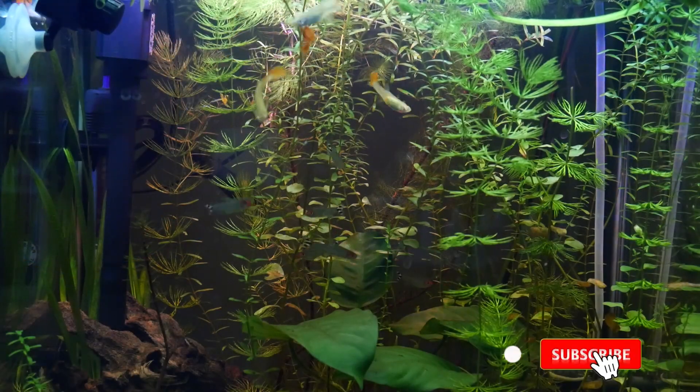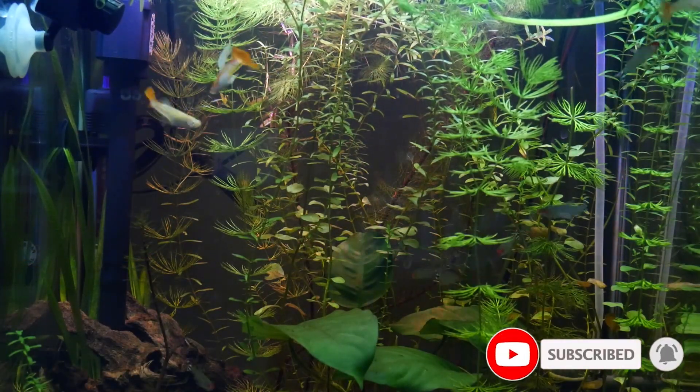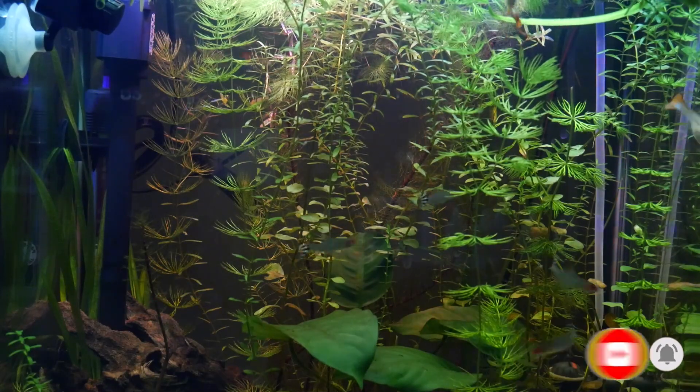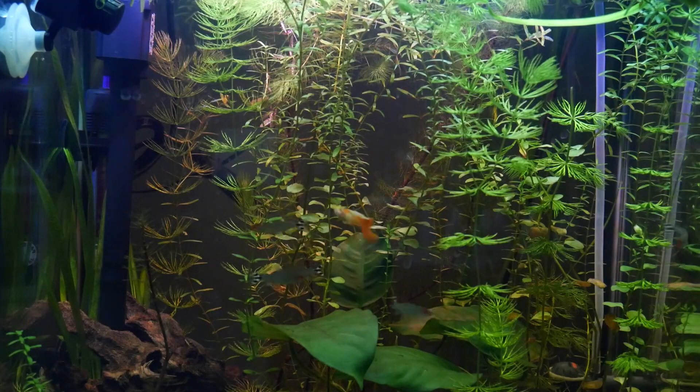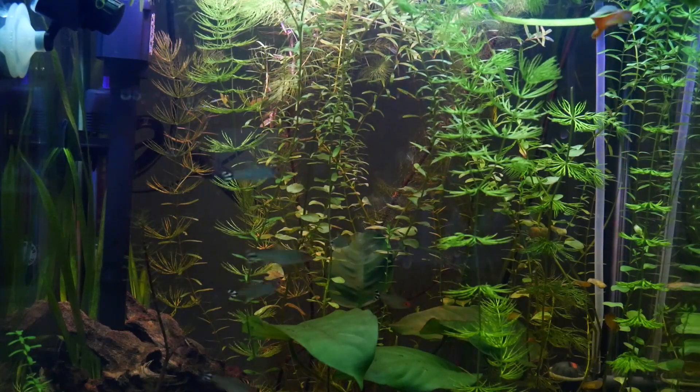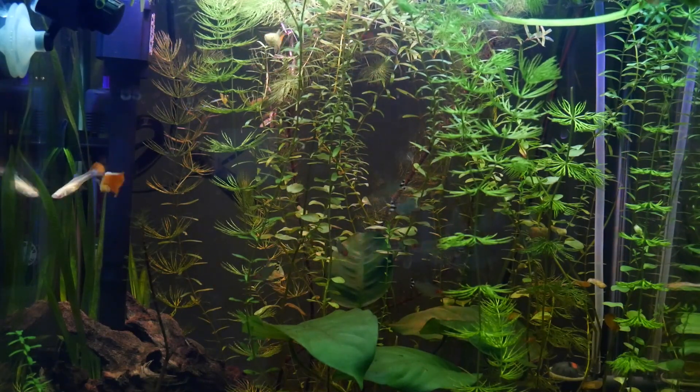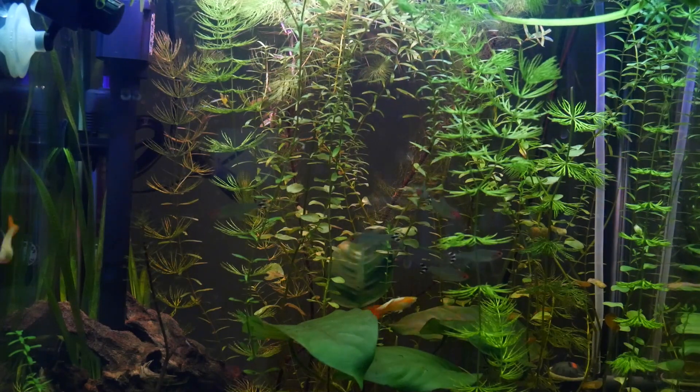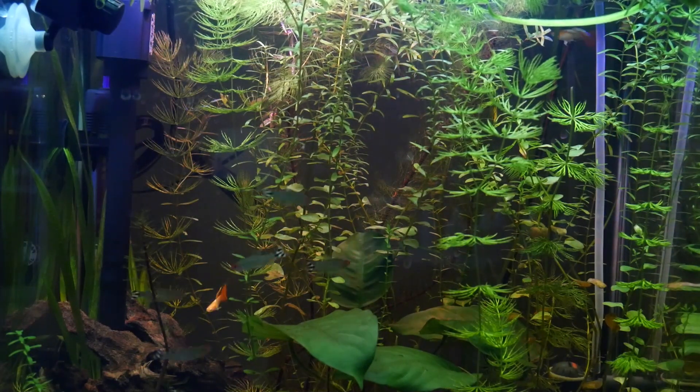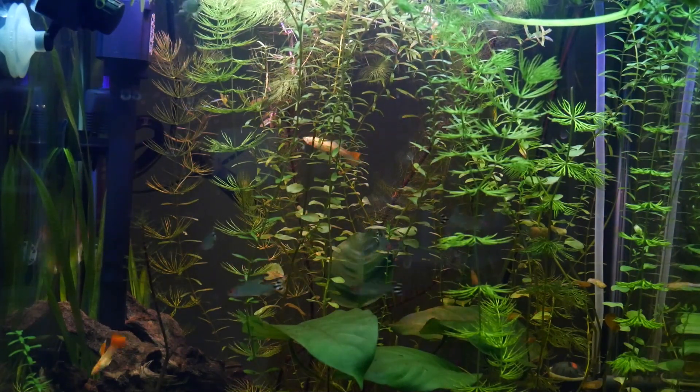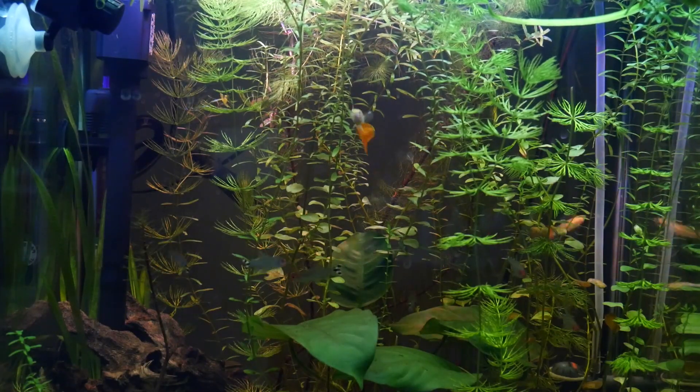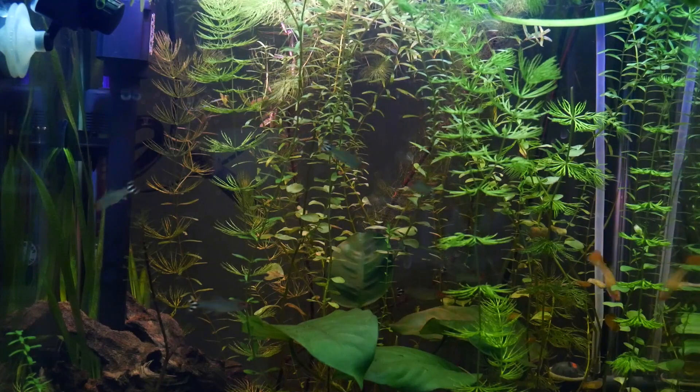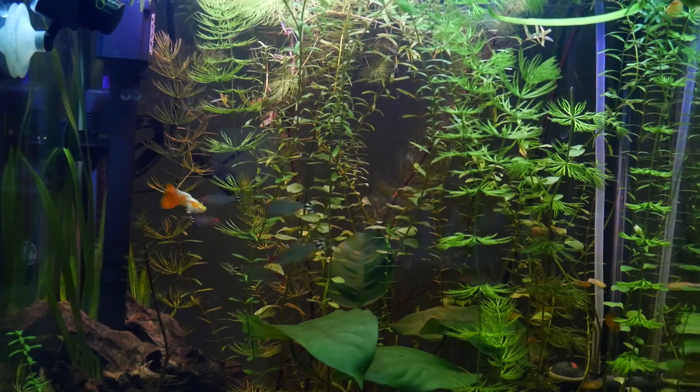To summarize, this kit contains all the basic tests that we need to do from time to time. I am quite happy with the results. Although the pH level was high, the fish look happy and I don't want to change it. We need to remember that the pH scale is logarithmic and if we reduce the pH from 8 to 7, we increase the acidity of the water by a factor of ten. So this can be very stressful to the fish and we don't want to do it.